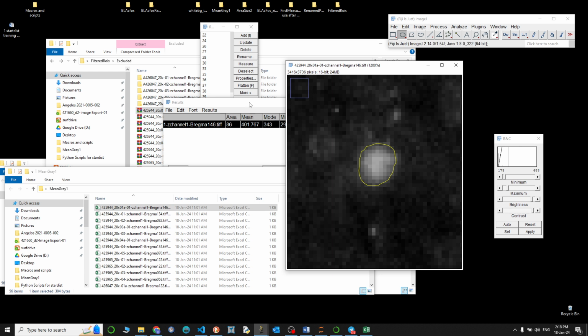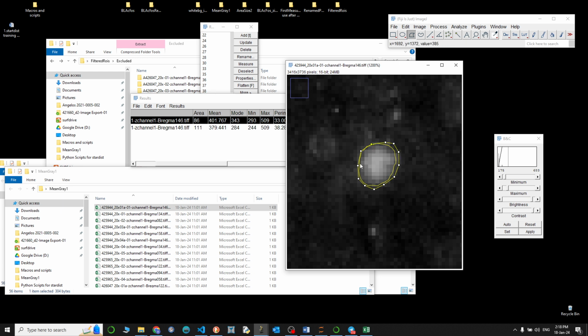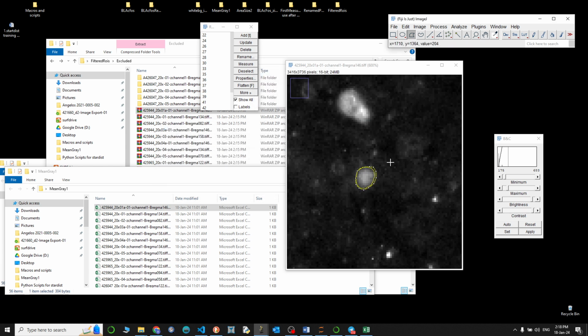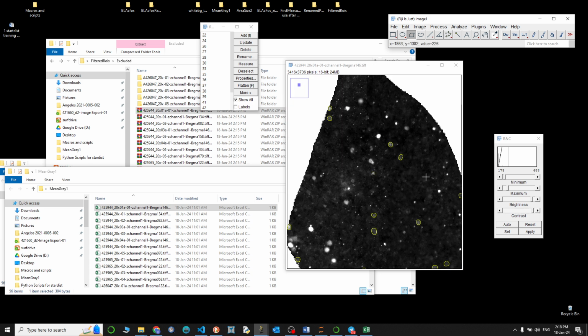Its area is small. Okay, is it the case? Let's see. Maybe its area is small, and I should lower my criteria a bit. Yeah, my measurement was a bit crude, but I think it's the area that was actually a bit smaller than 100. So I can know for next time that I can maybe change that part a bit.